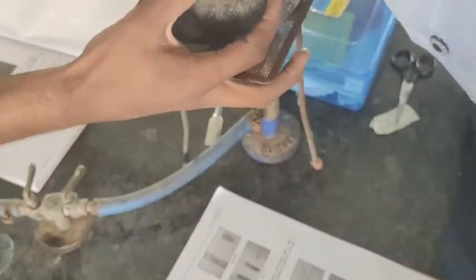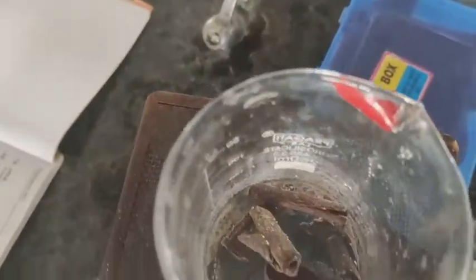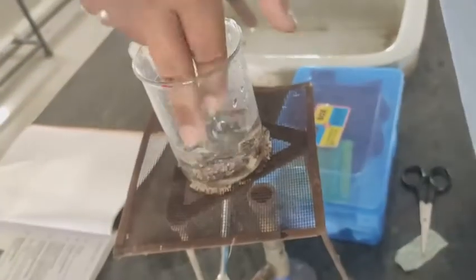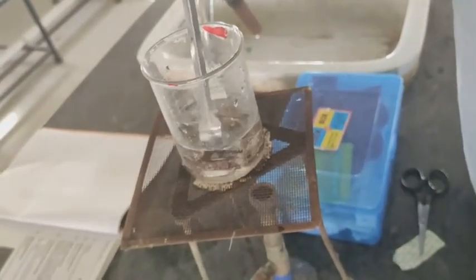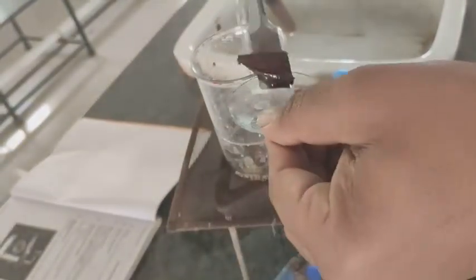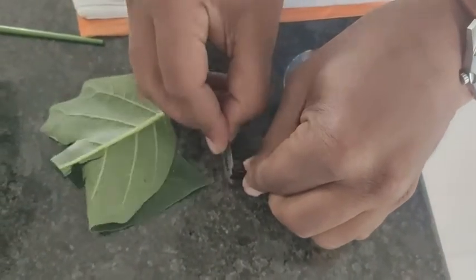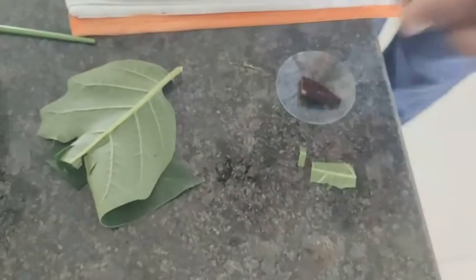After boiling, you can take the sample into the watch glass. Then comes section cutting, where you can cut your section. In this way you have to cut the section. Then transfer the section into the watch glass containing water.